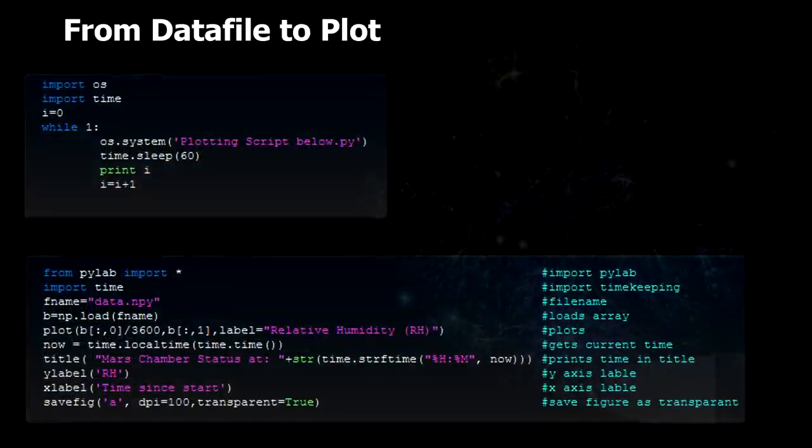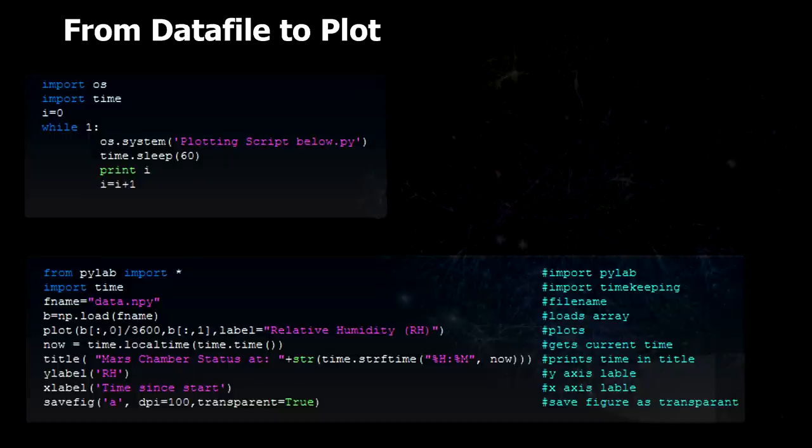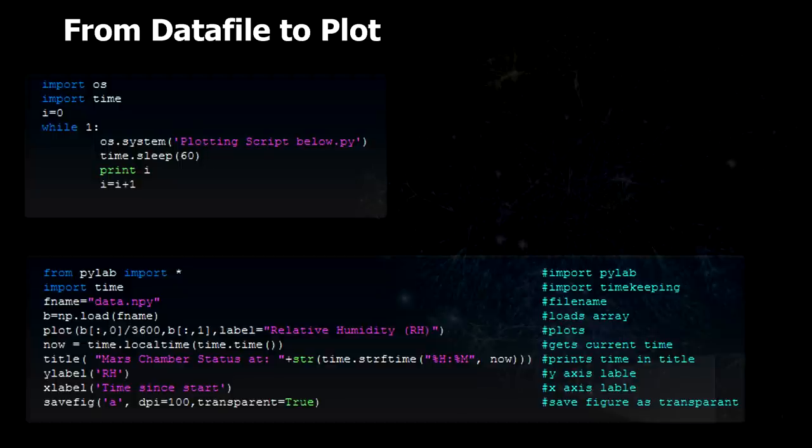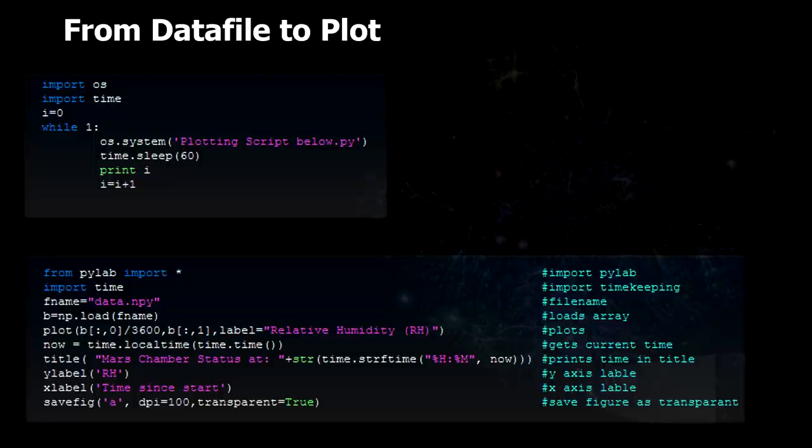If we take a look at the code, the first python script imports the operating system library and the time library. Then it goes on in an infinite loop, taking and running the script below and sleeping for 60 seconds. Then it prints the iteration. The second script actually does the real plotting. It takes the first column of the data set and divides it by 3600, which is the number of seconds there are in an hour. And plots it against the real data in column 1. Then it prints out the time for the title and prints the title, puts in the labels and saves it as a figure I have called A.